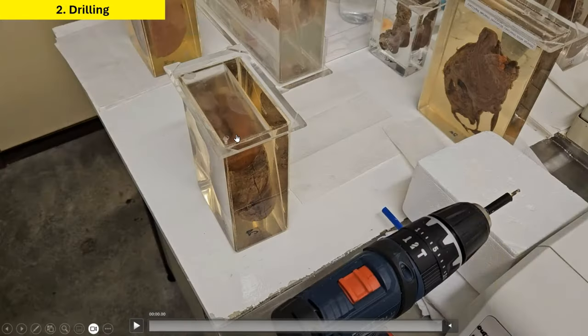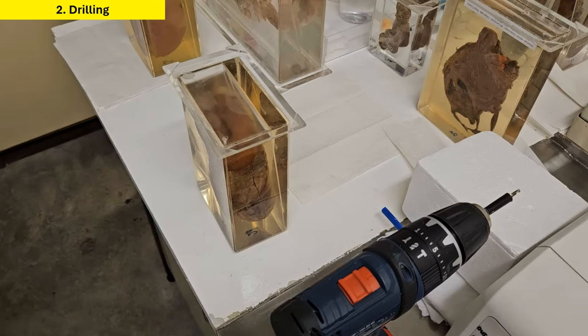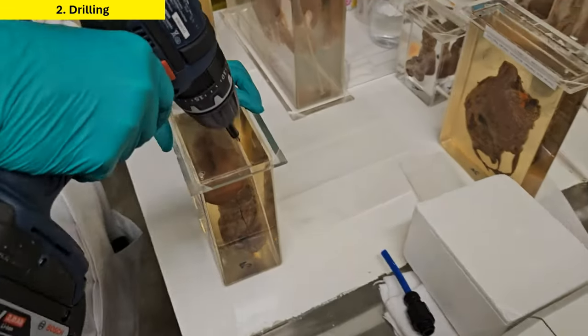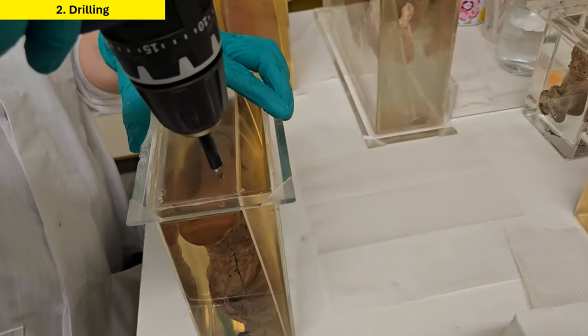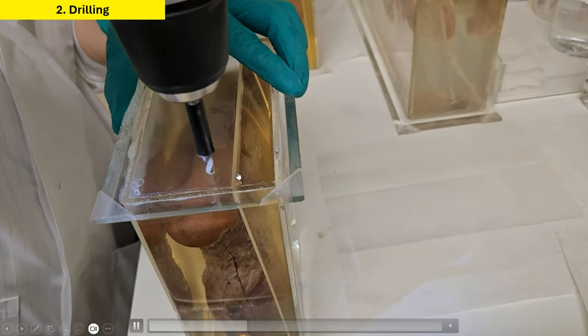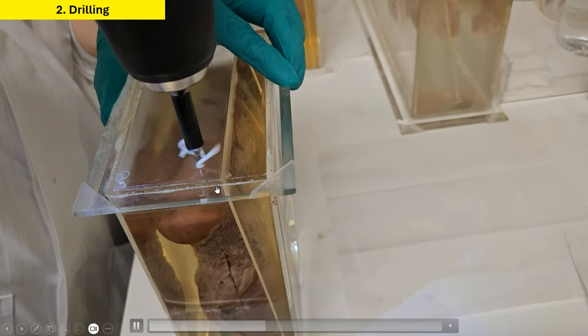Before drilling, we have to turn the specimen container upside down so that the base is facing up. For small pots like this, we can actually stabilize this manually with a firm grip. However, for larger specimens, it may need a vise clamp. So we drill a hole through and through, through the full thickness of the base.